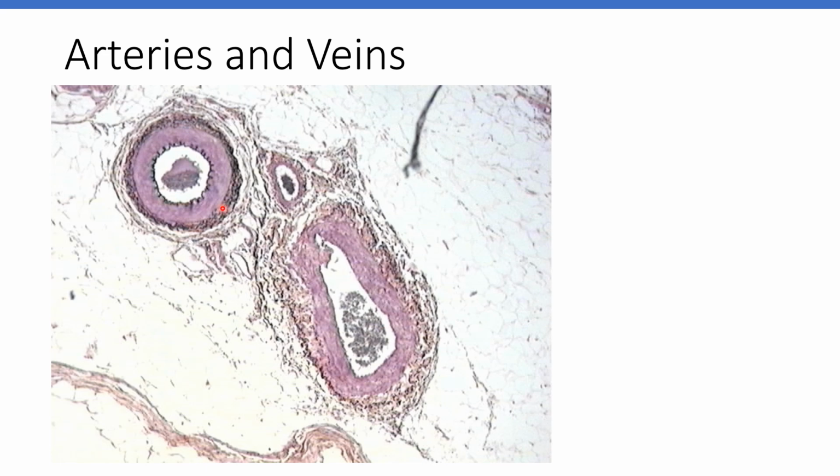And so a lot of times arteries will maintain their structure. The veins usually not. Now I mentioned adipose tissue, and you can see here that thin, almost clear area. This is where you could find adipose tissue. You do have dense irregular connective tissue. You also have smooth muscle here. It's a different type of tissue.